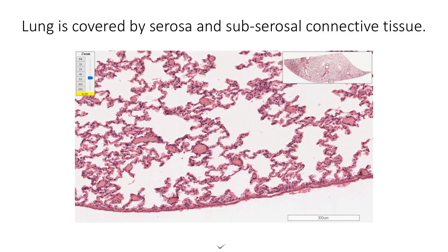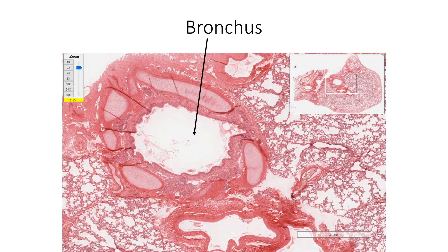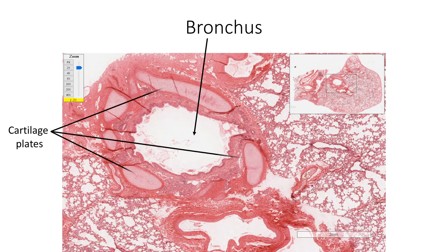Lung is covered by serosa, which is simple squamous mesothelium of visceral pleura and sub-serosal connective tissue. A section of lung usually shows the presence of one or more bronchi of various sizes. A bronchus can be identified by the presence of cartilage plates in its walls.